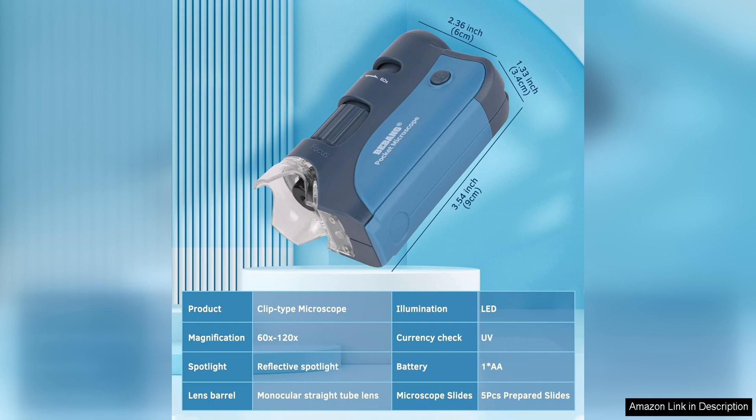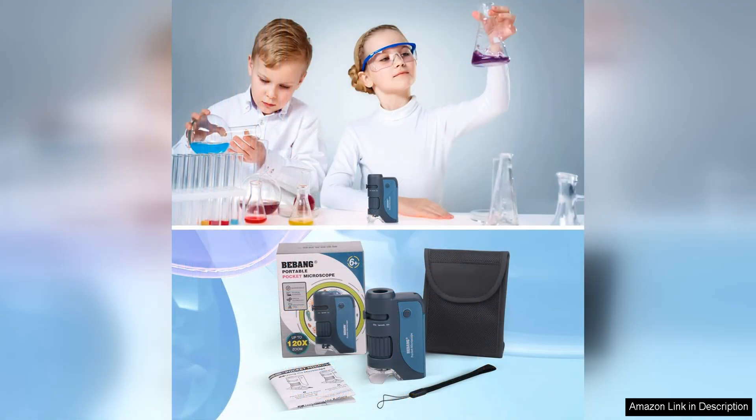Despite its small size, the Pocket Microscope feels sturdy and well-built. The textured grip provides a secure hold, preventing accidental drops during use. The compact design does not compromise on functionality, making it a reliable tool for both kids and adults.